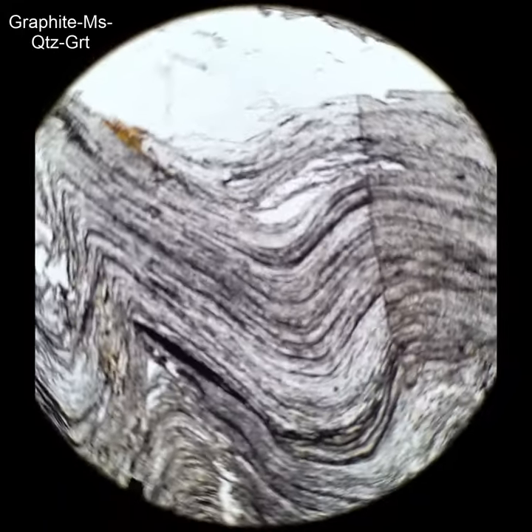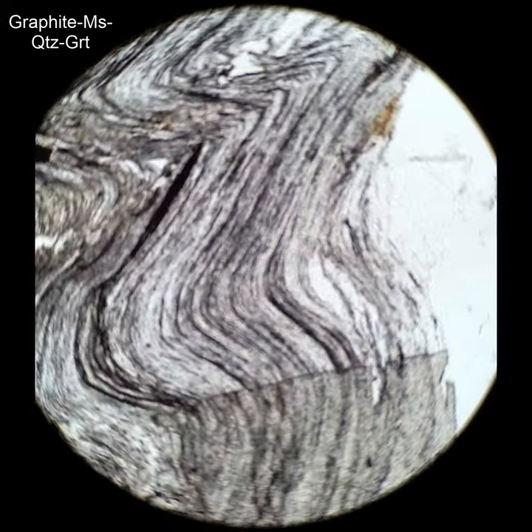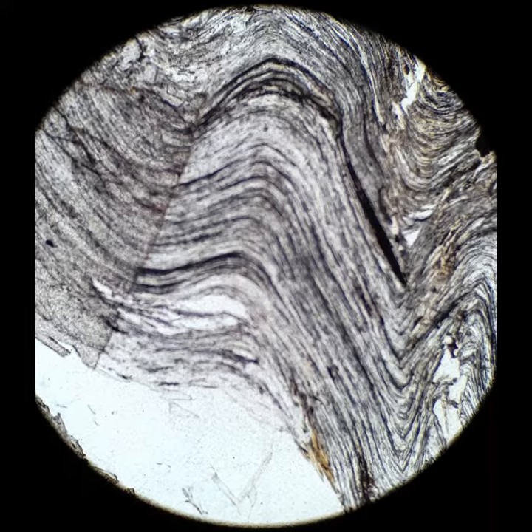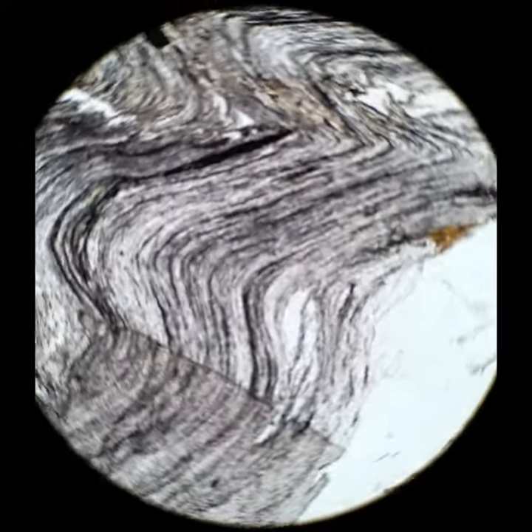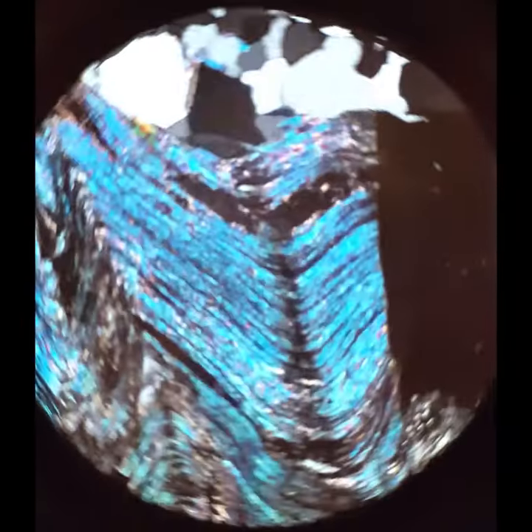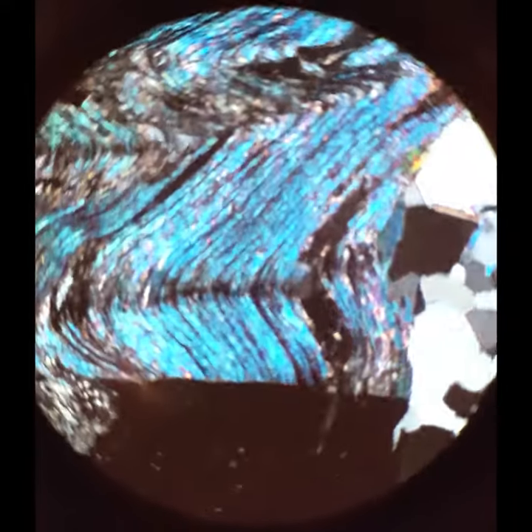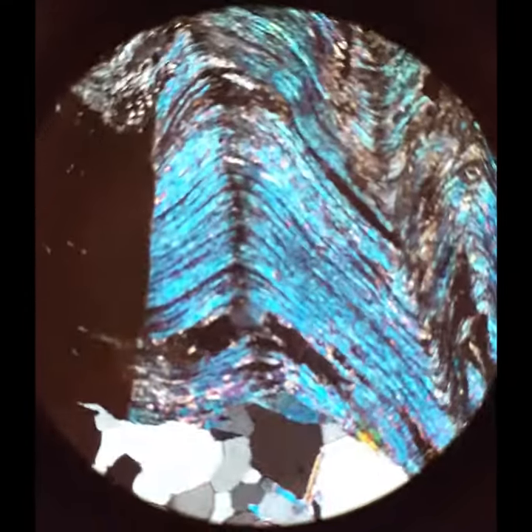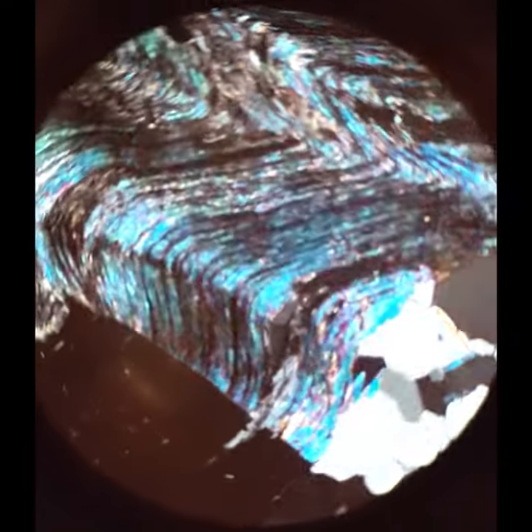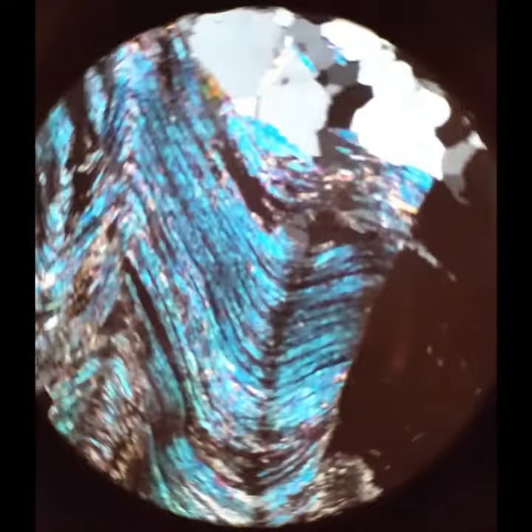This is an interesting one. In the center of the field of view is muscovite that has a bunch of graphite inclusions in it. But there's also garnet, which is the high-relief crystal just to the right at the edge, that also has a bunch of graphite inclusions in it. You can see the muscovite is bent and it has that undulose extinction — it's really typical to see this fine-grained layering in muscovite and in garnet.